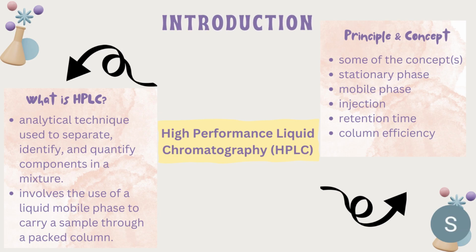Hi, I'm Stephanie and I will present about the introduction of HPLC. So what is HPLC? HPLC stands for High Performance Liquid Chromatography and it is a powerful analytical technique used to separate, identify and quantify components in a mixture.